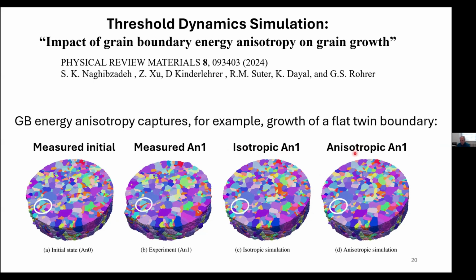Whereas when we use basically an interpolation formula for the grain boundary energies, and put that into the simulation, and that was a major development in this threshold dynamics simulation, being able to put in the different energies for different kinds of grain boundaries. This looks actually amazingly like the measured data after annealing.